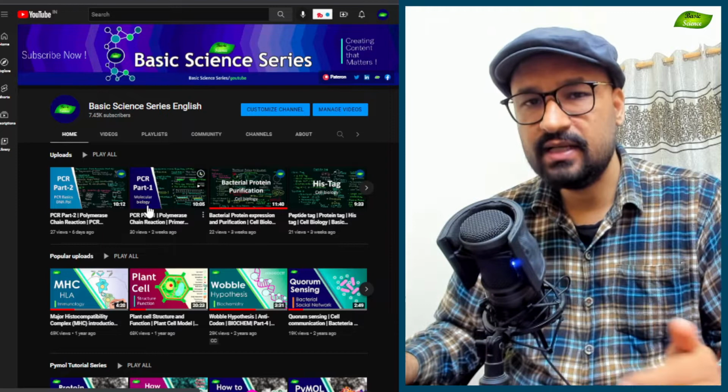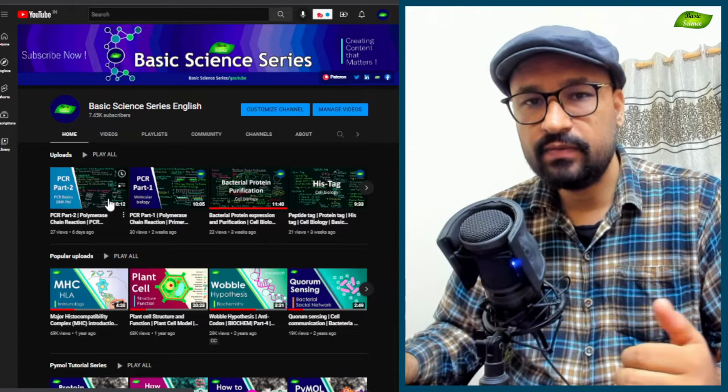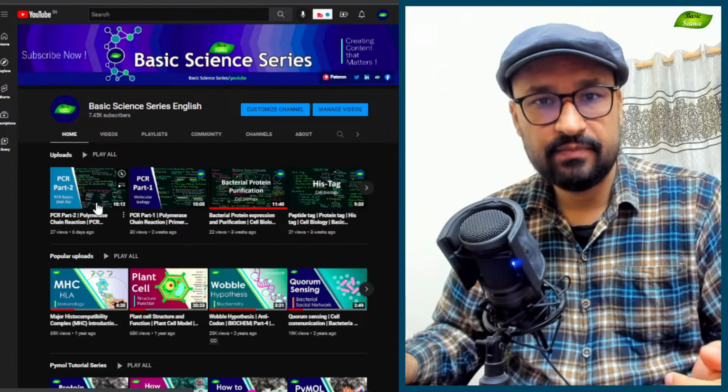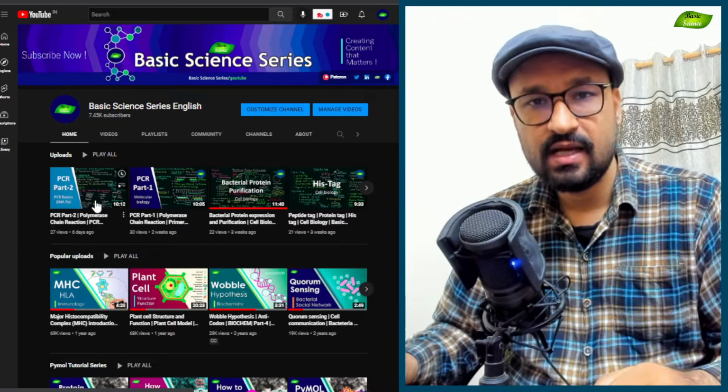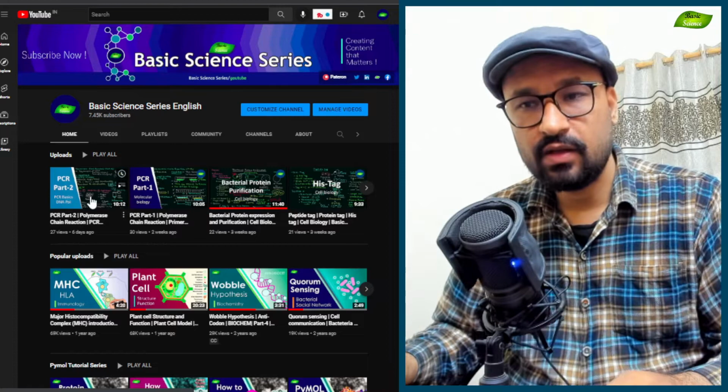But I thought I should make another, more interactive video, where I can show you how you can use some of the tools that are available for primer designing. So we'll start by exploring the web and see what tools are already available, updated tools. I'm using one of the tools for primer designing. I'll explain in a little bit of detail about that specific tool. And we'll also try to explore some of the available tools. Maybe there are new tools available, right?